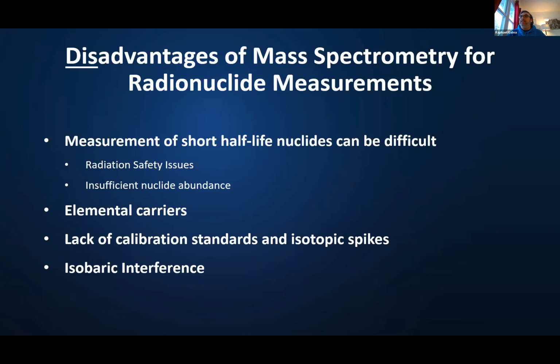In the example I was giving with the protactinium, the sample was prepared at Lawrence Livermore National Lab, and it was perfectly suited for their application, whereas for the radiometric, there was this impurity that significantly affected the radiometric measurements.